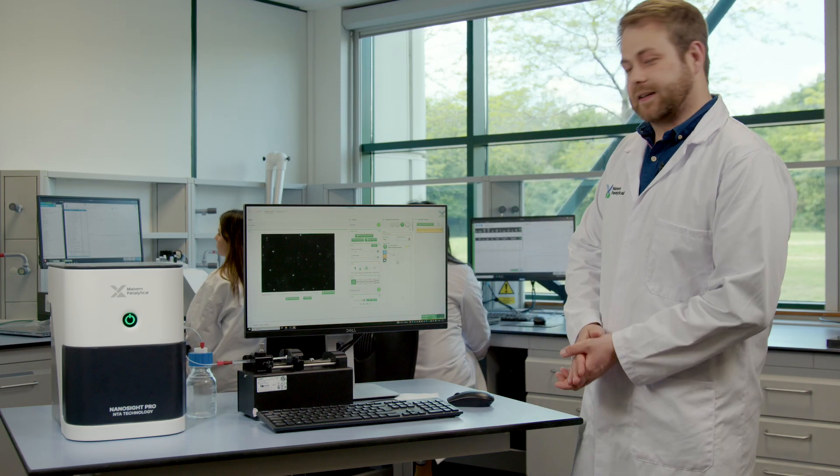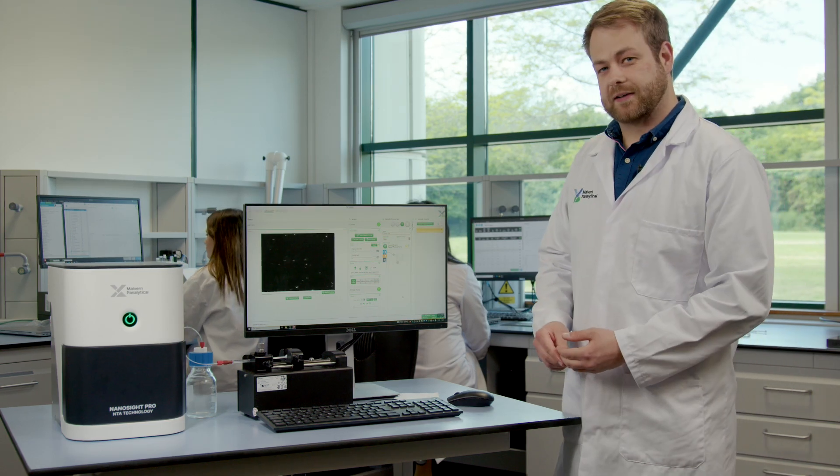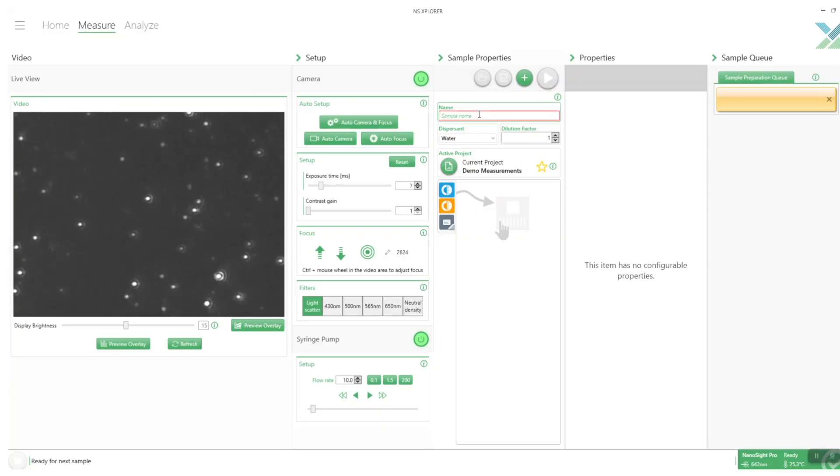Now that we've got the flow going we can set up the measurements. We start off by giving it a name. Our sample is exosomes so I'm just going to call it that and these exosomes have been labeled with a membrane dye which allows us to do fluorescence measurement.